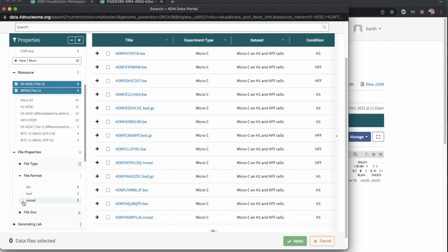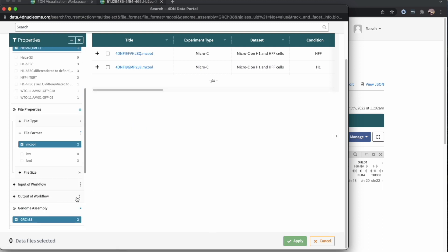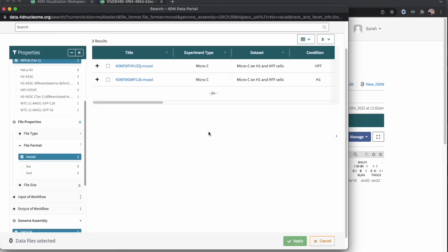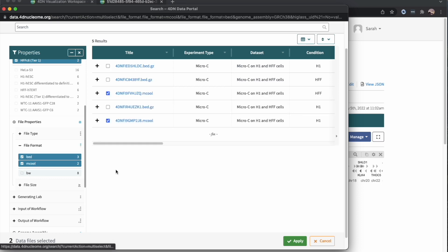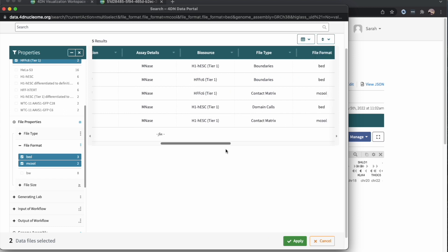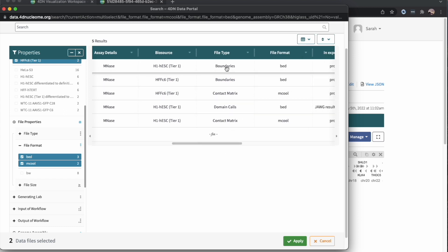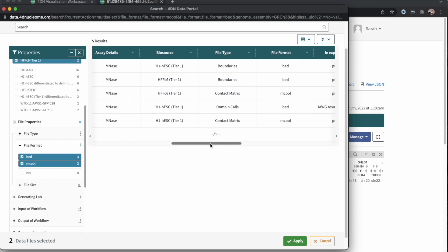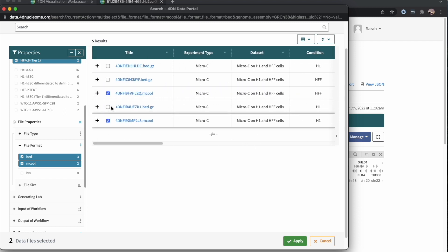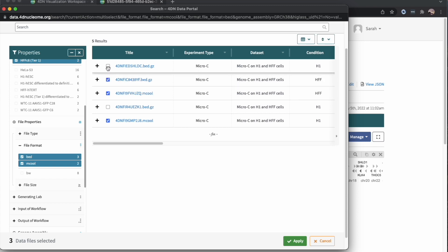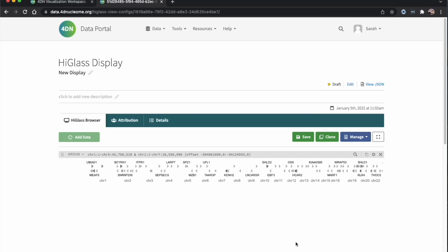Then I'll also first look for the M-cools, which are the contact matrices. So I'll click on this HFF and H1. Then I'll add the BED files, which include boundaries. So the HFF and H1, I can click on Apply.